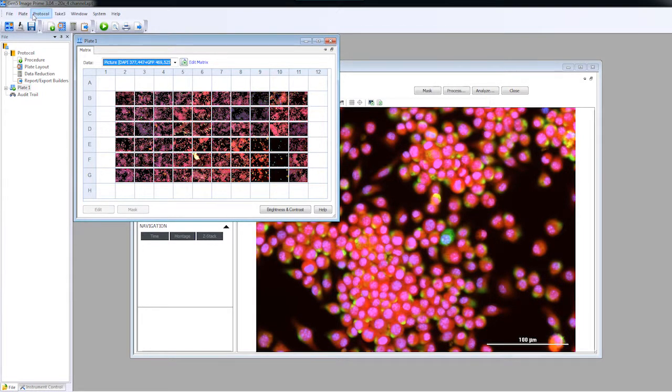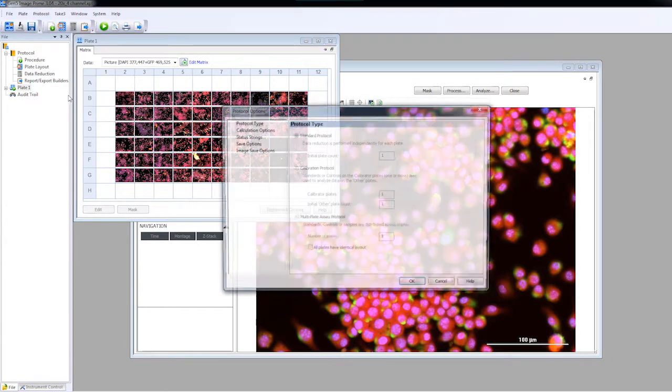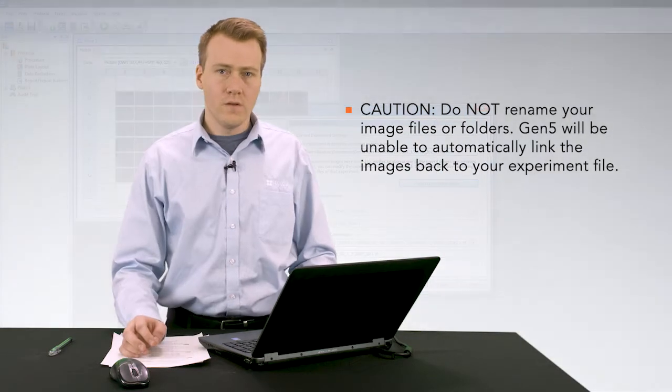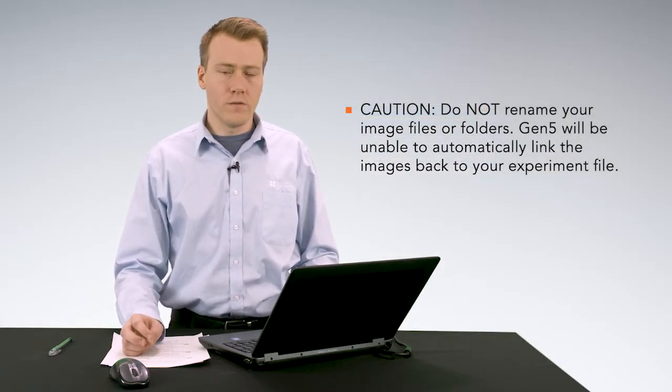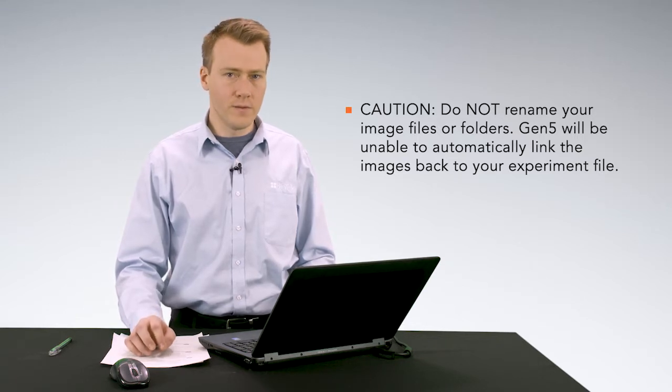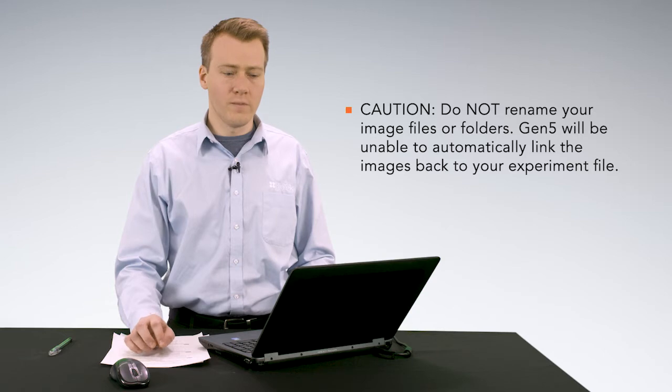To confirm that, we can go back to our protocol options, image save options, and see now that the folder where the experiment file is also the image save folder. A word of caution: do not rename your files or folders. If the files or folders are renamed, Gen5 will be unable to automatically link your images back to the experiment file.